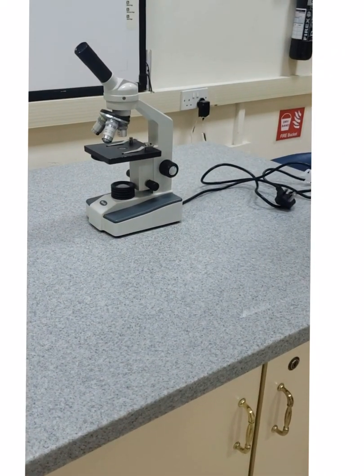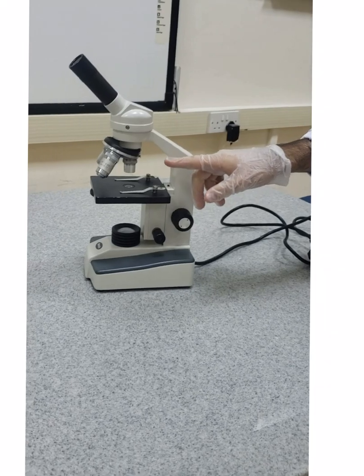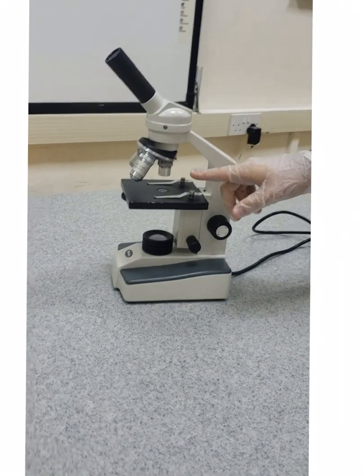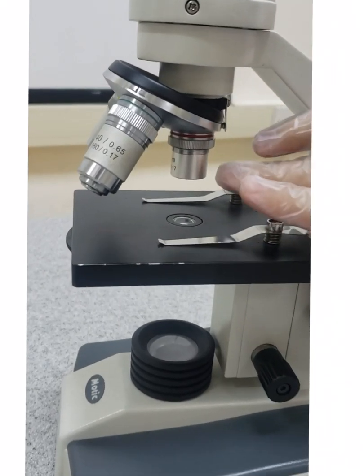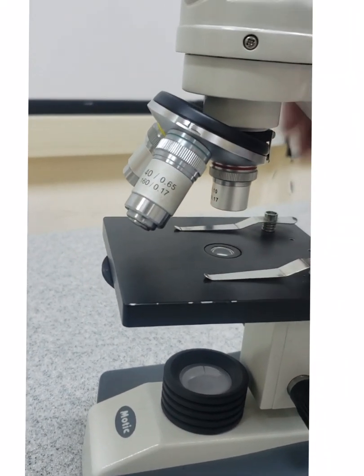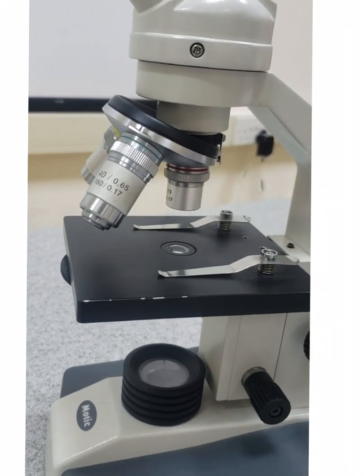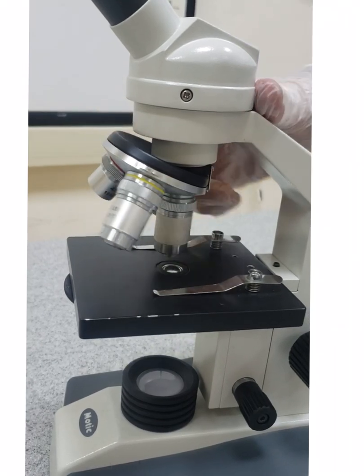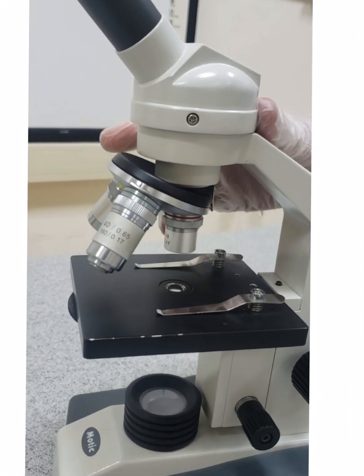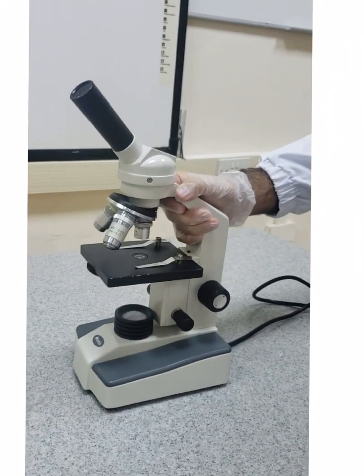Number 2, the microscope should be stored with the least objective lens in place. As you can see here, the 5 times is in place. Always store the microscope with the least objective in place. When I'm done using the microscope, I will rotate the nose piece to the least objective and return it back to its place. Okay?